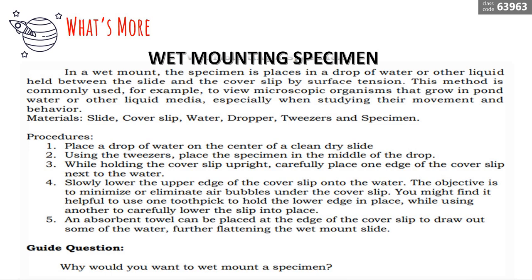We will need a slide, cover slip, water, dropper, tweezers, and specimen. So here are the procedures. Place a drop of water on the center of a dry slide. Using the tweezers, place the specimen in the middle of the drop.